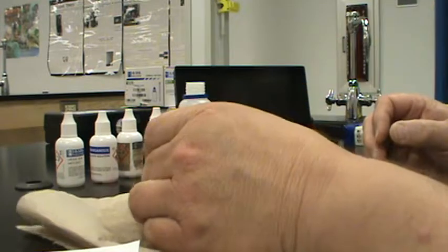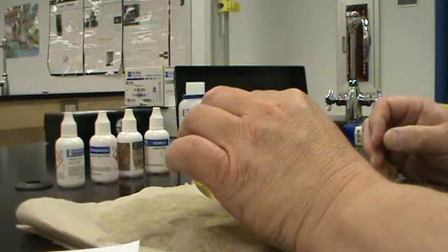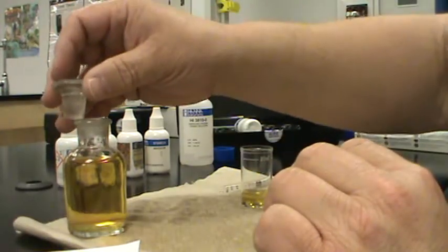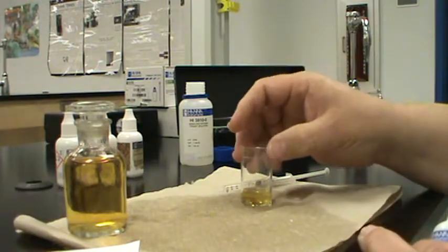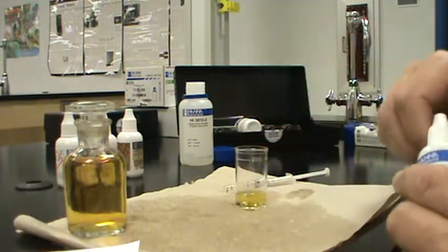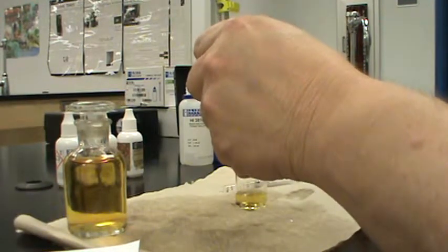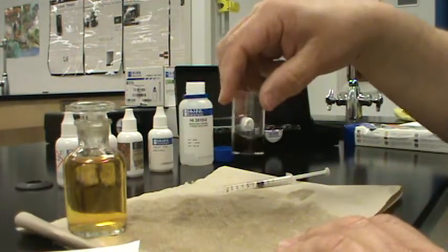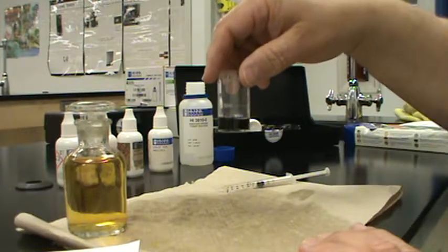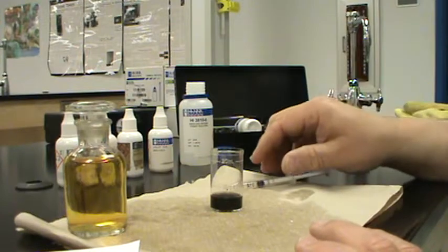Okay, we are supposed to take 5 milliliters of this liquid and put it in our smaller container here, so 5 milliliters. Then we are supposed to add 1 drop of the starch indicator. Notice how beautiful and yellow that is. We're going to add 1 drop of starch indicator. And we have now changed this from a beautiful yellow to almost a black. The kids call this a black, but this is actually supposed to be a deep, deep blue.